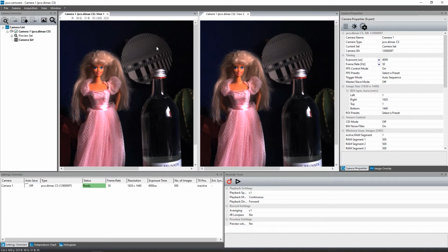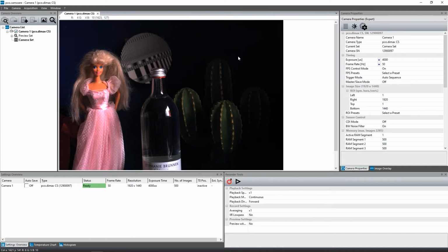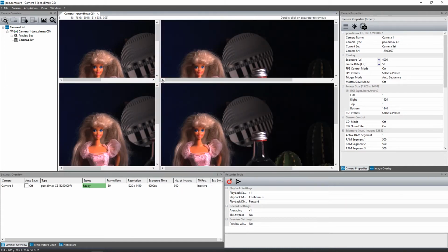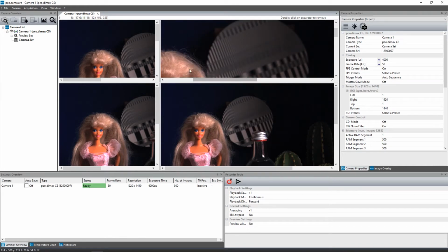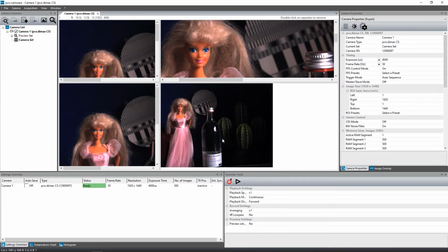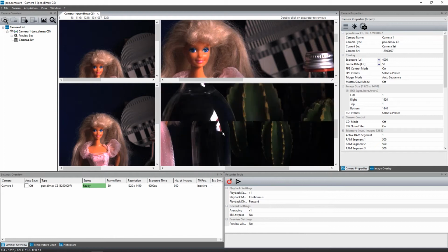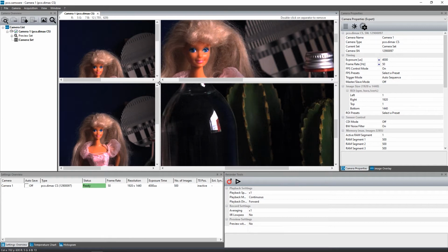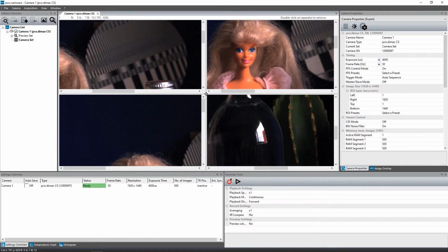The View window can be split into 4 divisions, which allows you to easily track 4 different views of your application. Use the Zoom plus or minus button available in the context menu to adjust the level of detail in every view window individually. The zoom level can also be adjusted with the corresponding plus and minus keys on your keyboard. The size of the split window elements is easily adjusted by grabbing and dragging the dividing lines. To undo the split, double-click on the dividing line.